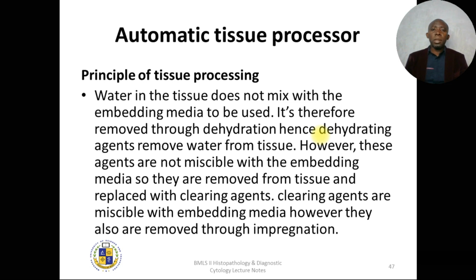So for now, I will end my tutorial here, and in the next presentation, we shall look at the automatic tissue processor, and see how these automatic processors operate, their advantages and disadvantages.